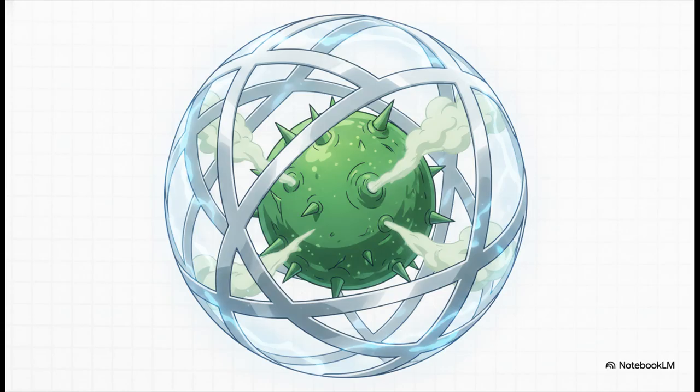Well, it all comes down to what we call the chloride problem. Wastewater is almost always full of chloride ions. Without mercuric sulfate in there to mask them, chloride would react with our silver catalyst and precipitate it straight out of the solution. Even worse, the dichromate would oxidize the chloride into chlorine gas, which artificially inflates our oxygen demand readings. So mercuric sulfate prevents this false positive, ensuring our data is perfectly accurate.